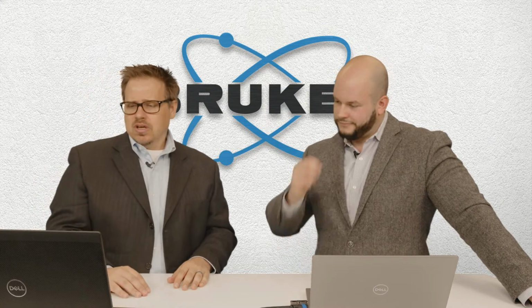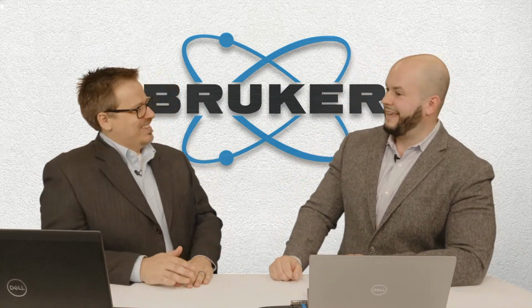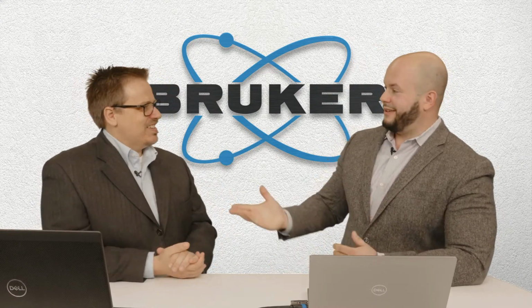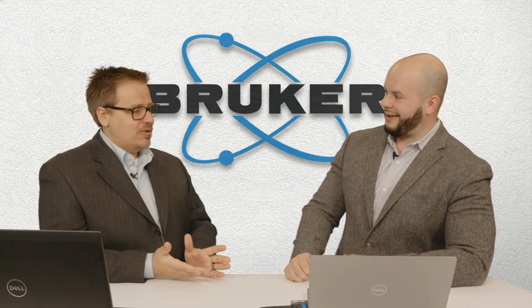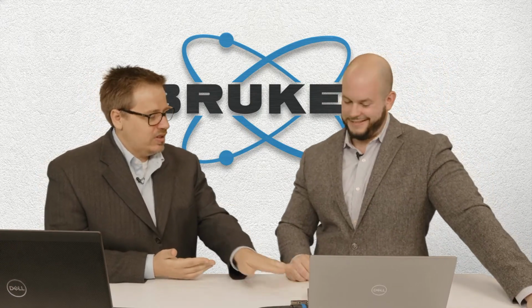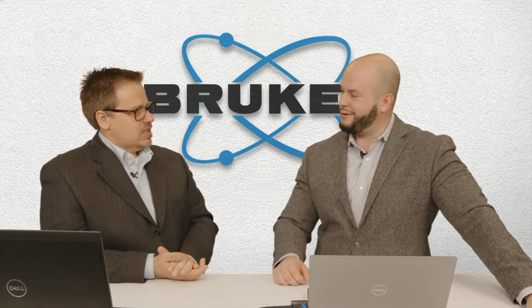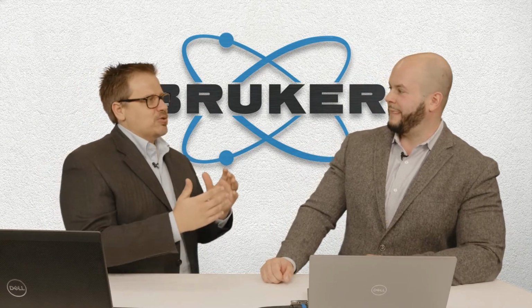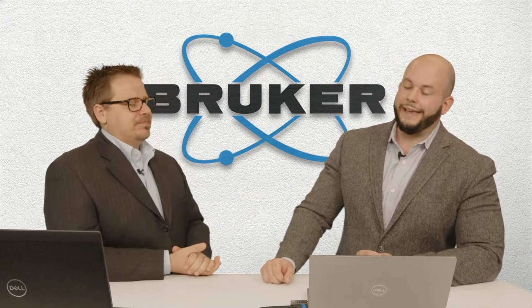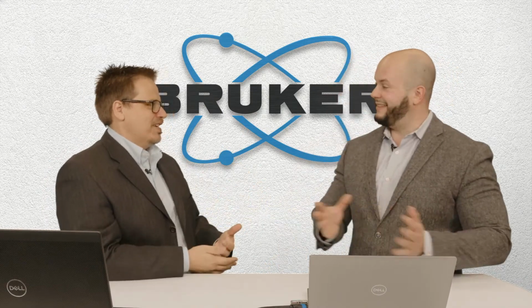One more question here, the last question, from Robert. How long does this all take? So how long does a scan normally take? Well, you saw how the analysis takes less than a half hour. Right? And I was really astounded at how quickly it ran even on just your laptop. This stuff wasn't pre-done, you were doing it here live. No, this is all rendered right here, live. So how long do the actual scans take? I mean, come on, there are a lot of rotations, a lot of tilts. There's a lot of data in these pole figures.